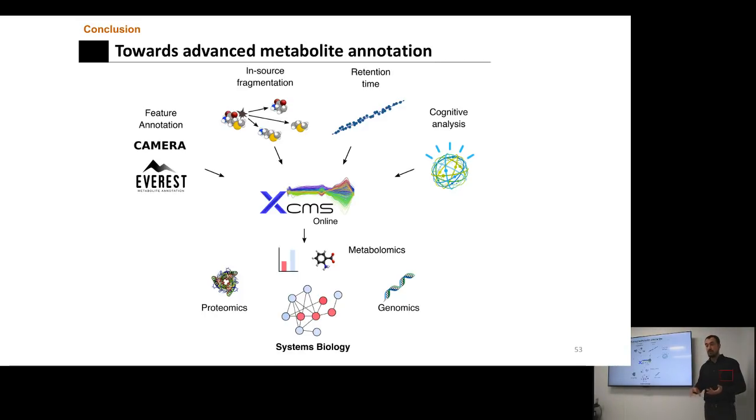But if you really want to identify this molecule, what you have to do is, of course, fragment the specific peak corresponding to that feature by using tandem MS, and then try to find, again, using METLIN, but now using not just low energy, but the best collision energy that you can use for that specific peak, and identify that spectra by using proper tandem MS fragmentation information.